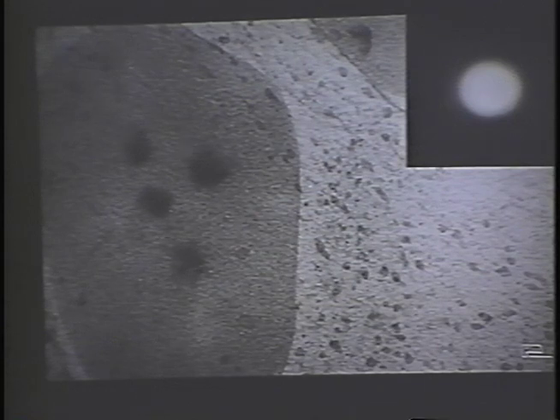In contrast, PTK cells which have been critical point dried have an electron diffraction pattern that differs from the frozen hydrated material and is characterized by 2 diffuse rings around a central maximum, which do not undergo transitions to a crystalline form upon stage warming. Next slide.